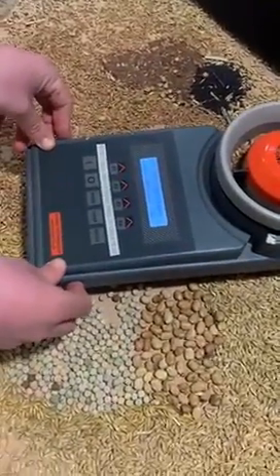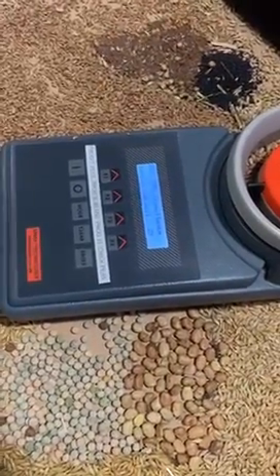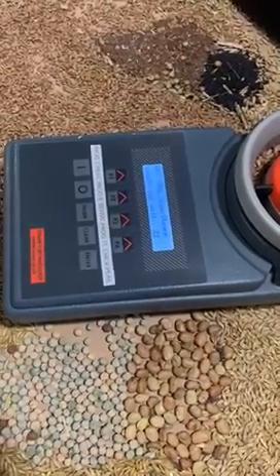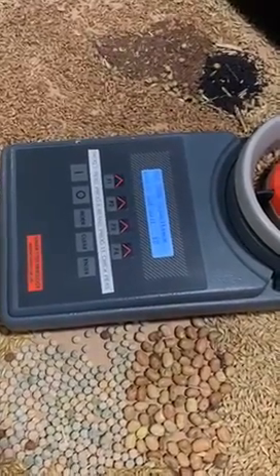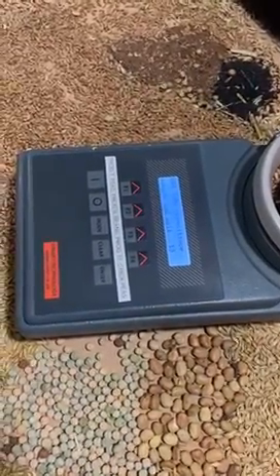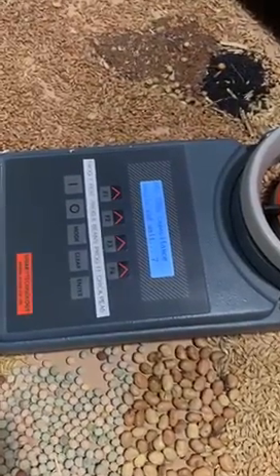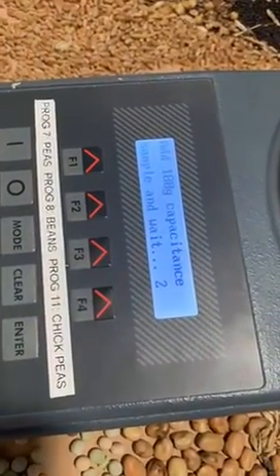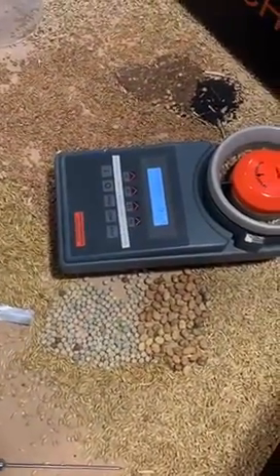Now we need to wait for the timer to go down. Once complete, this is where we enter our capacitance and temperature.